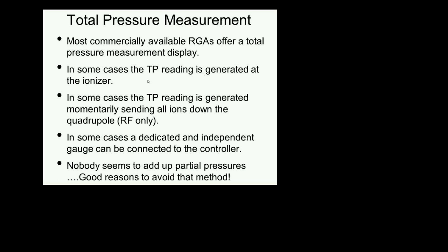So don't rely on the total pressure measurement of the RGA for your general pressure measurements in your system.